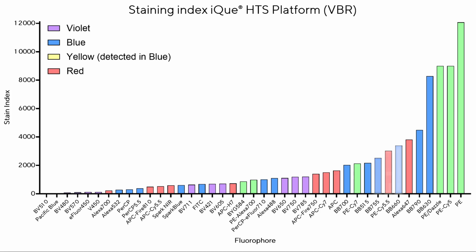Generally, it is preferable to use brighter dyes to quantify lowly expressed markers and dimmer dyes for highly expressed markers. For example, CD3, 4 and 8 are typically highly expressed and so could be stained using a dimmer fluorophore. Conversely, CCR7 is a weakly expressed marker, so may benefit from staining with a bright fluorophore with detection in one of the stronger channels like VL1, BL1 or RL1.